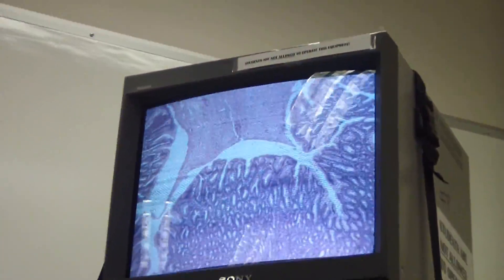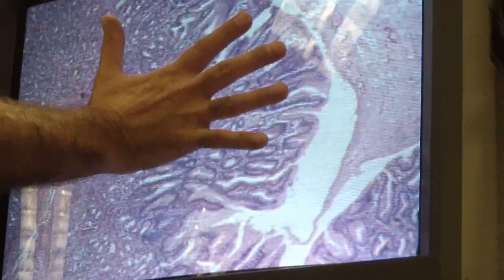Remember again, this is the stomach right here. These are those gastric pits. In fact, these are all simple columnar. If you want, you can go to 40 and take a look at the simple columnar cells.